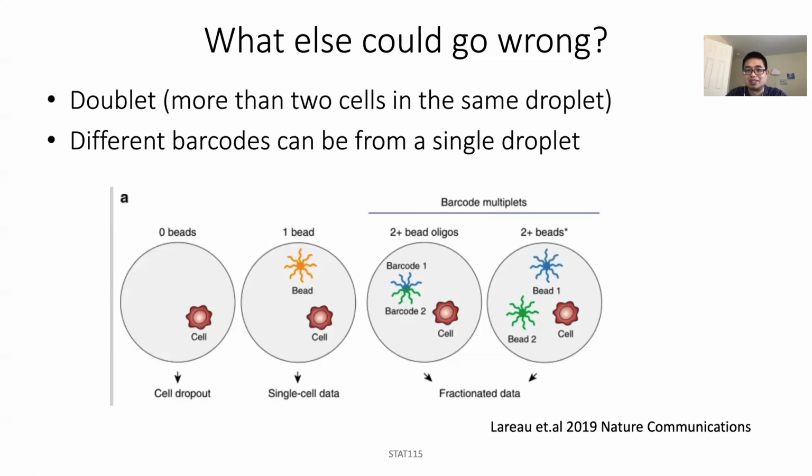This is the 10x solution. This brought attention to them, and they later fixed this problem. So the idea is that you don't trust the data other people give you, and you also don't trust the specification that the commercial solution tells you. You really need to do a lot of sanity checks or investigation, some detective work.